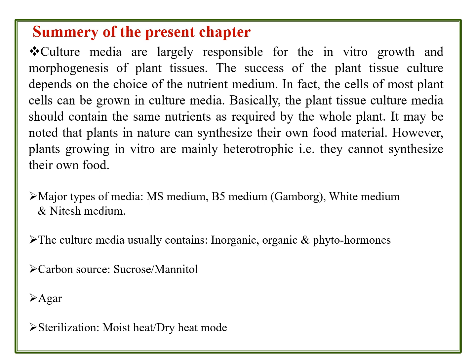That's the reason why all the macro and micro elements, in addition to the organic substances in plant tissue culture media, are formulated in advance based on the objective. The salts are designed and formulated. If anything goes wrong with the formulation or design, further growth may be retarded at any stage. If it is a callus culture, of course, the first phase callus may be obtained, and then on secondary subculturing, the callus may not go further and develop into further callus.